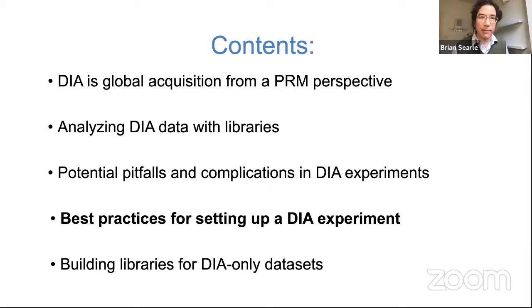Where we actually see a lot of faults is in doing DDA analysis. In fact, from our perspective, based off of the information we've learned from analyzing phosphopeptides with DIA, we think that you can't really get robust information about phosphopeptides from DDA. So we think that DIA is a perfect tool for analyzing phosphopeptides, but you have to be smart about how you analyze them. You have to use the right software. You have to think about it a lot.